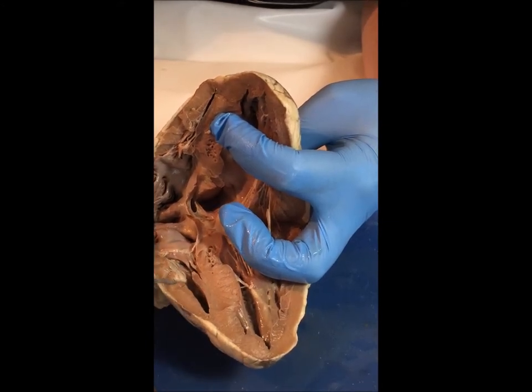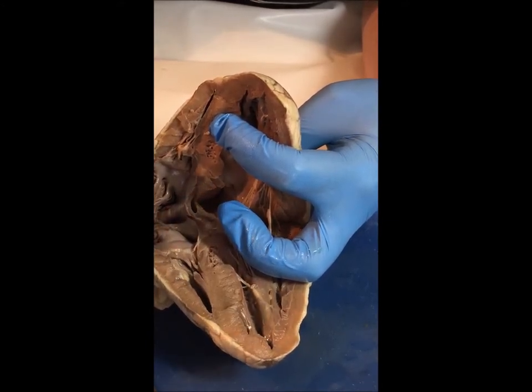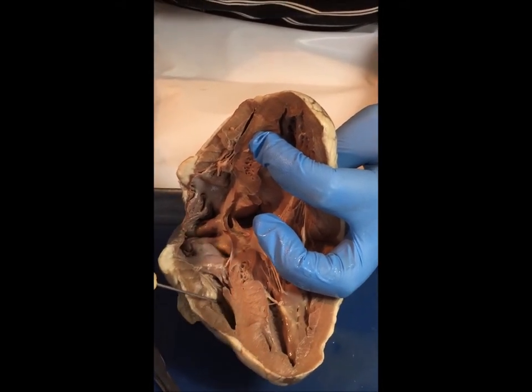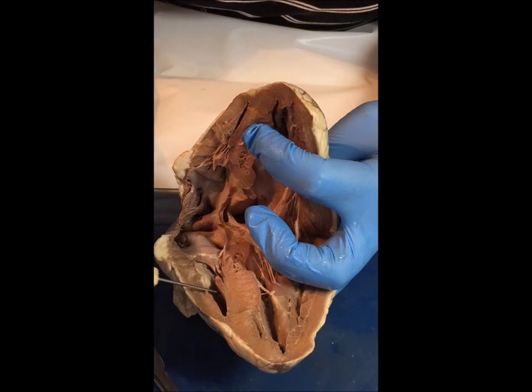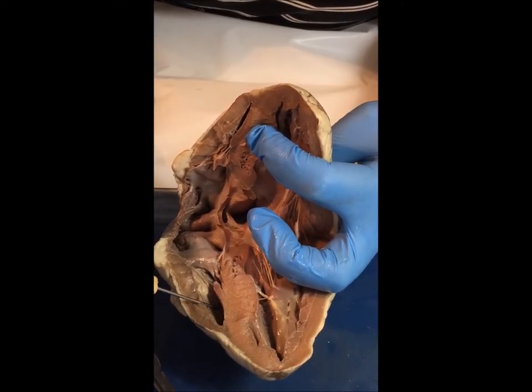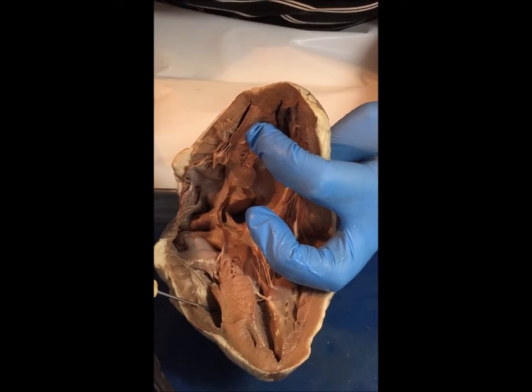The blood would flow through here. Remember that it's deoxygenated blood at this point, and it would come into the right ventricle. If I were to put my needle tool here, it will come out of the heart through the pulmonary artery, and that will go to the lungs.